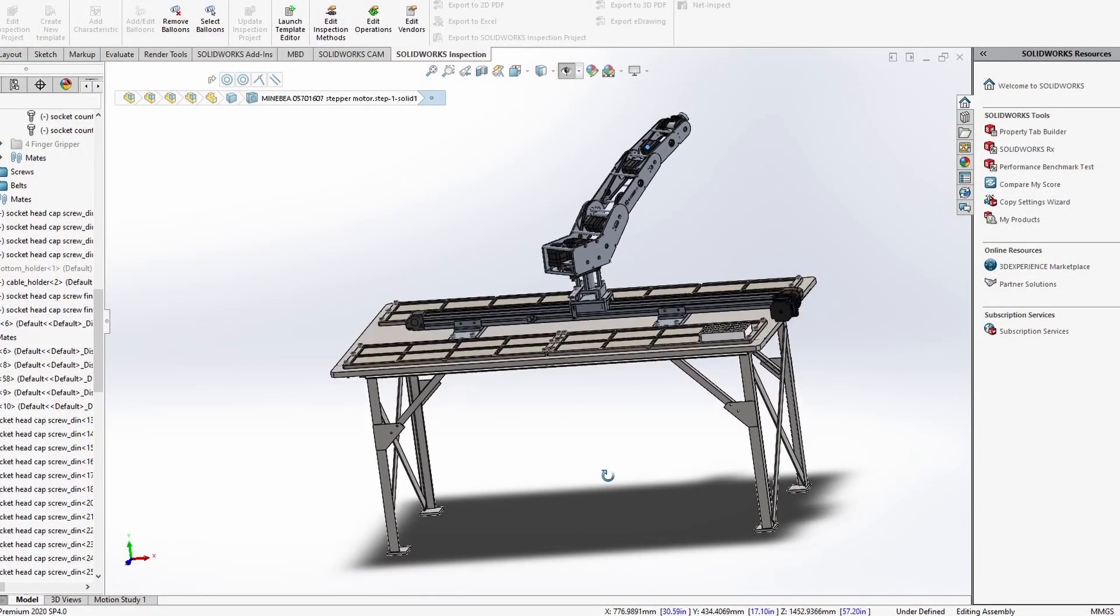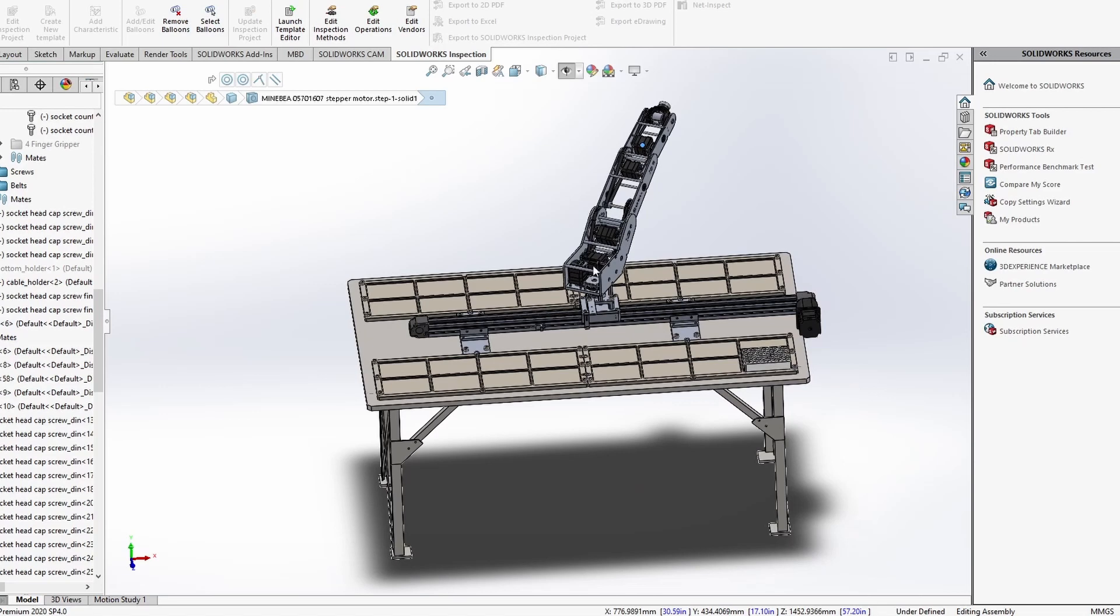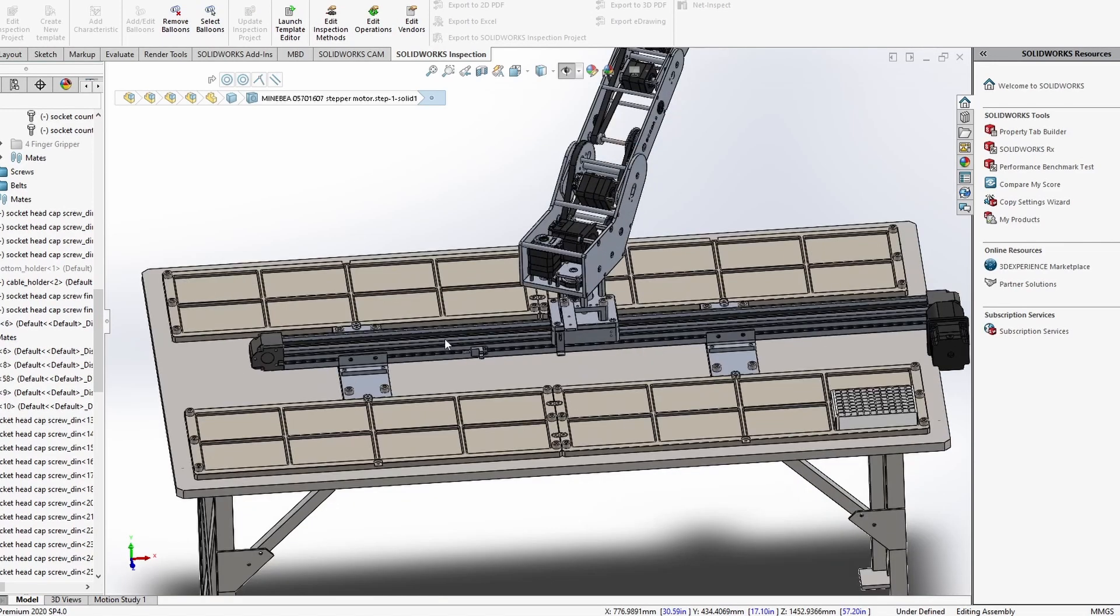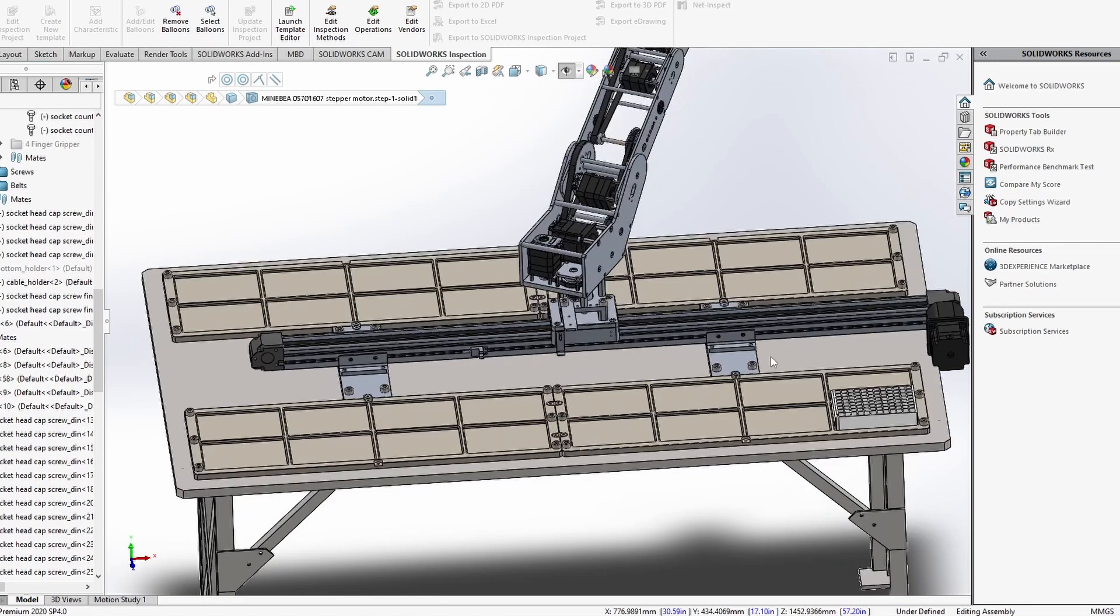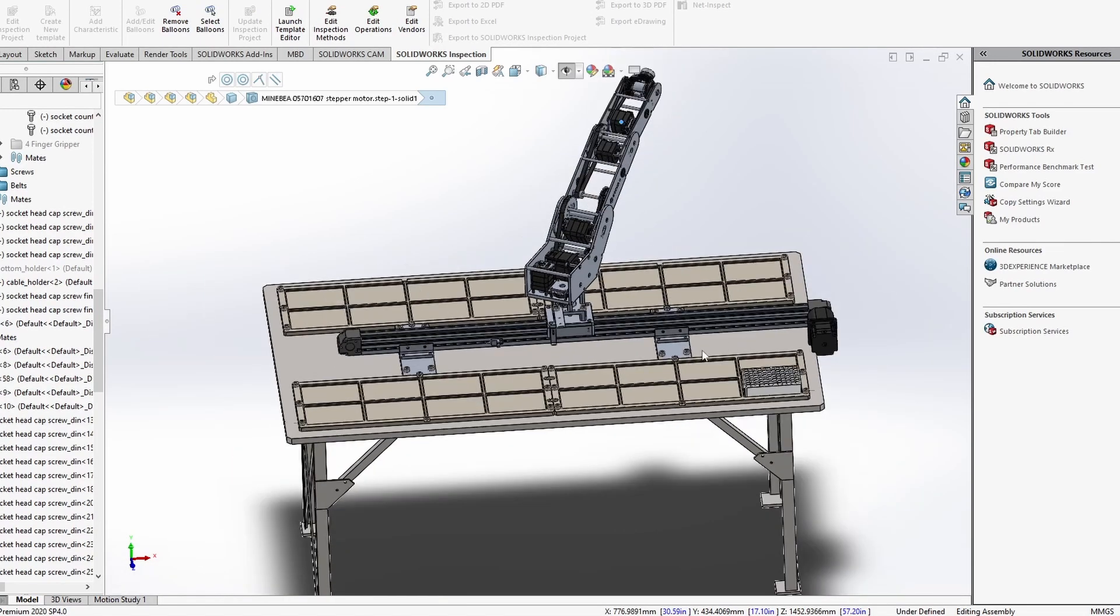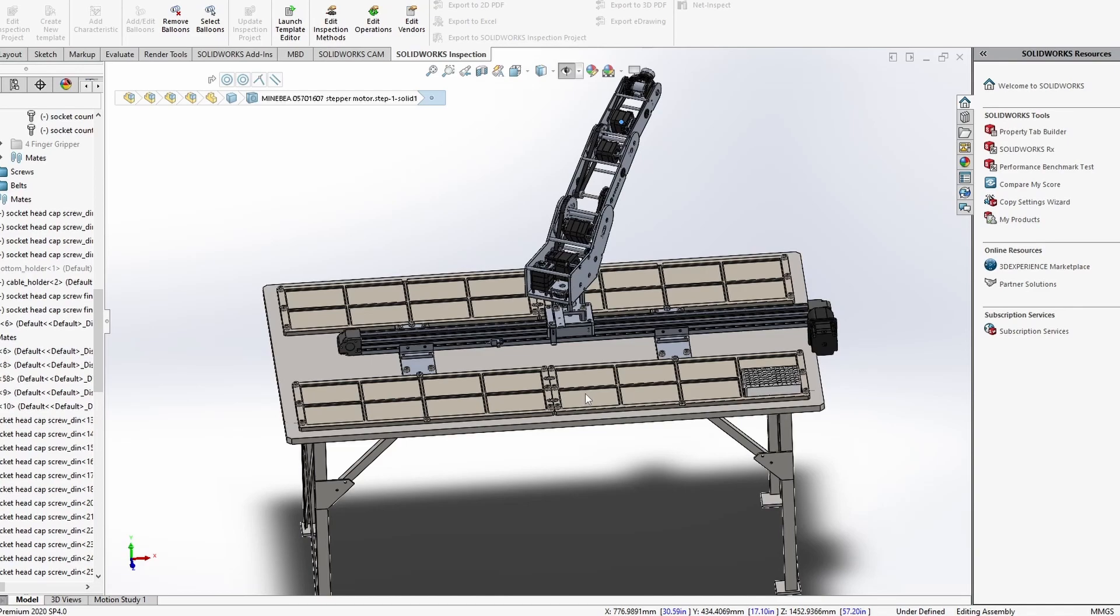As part of our solution we used the 1 meter rail with the robot. This gives the robot full access to all points on the desk to work on. For the fixturing part we made 4 fixture plates where each plate can hold up to 8 microplates. The fixture plates and the rail are connected together so the relative positions are fixed.